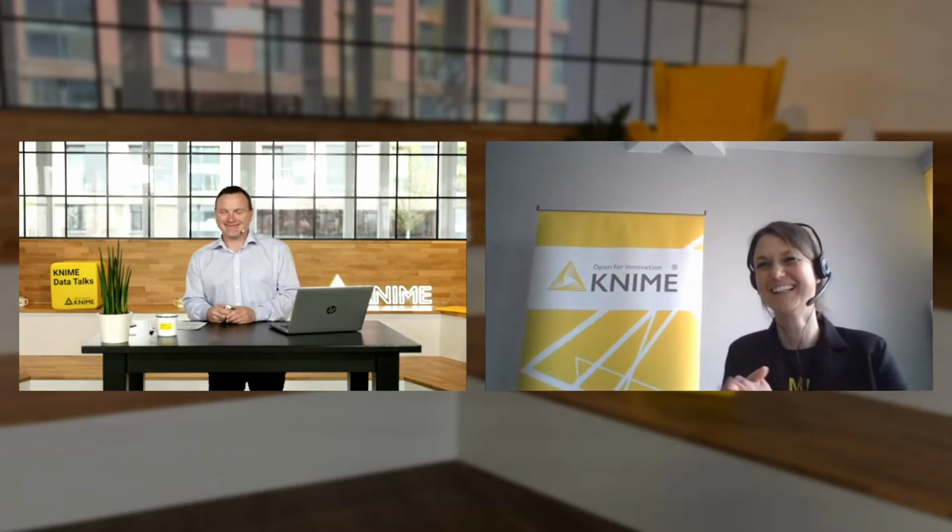If you want to change the system or evaluate something different, you have a lot of nodes in the Knime universe which you can use, so you can iterate, be agile, tune your systems and get better, and you can do it on your own. We'll see later in the talk, if you couple these two systems, you're free to invent your own analysis and feed it back into the lab. Cool. I think now we all want to see how to invent our own analysis.